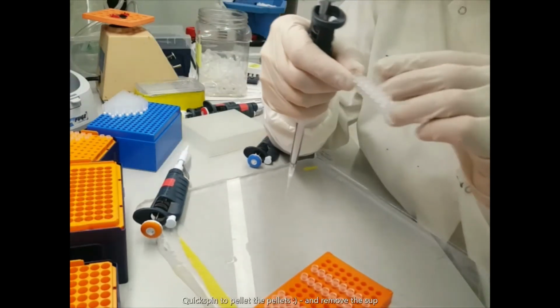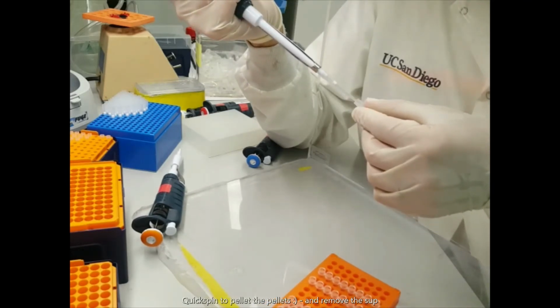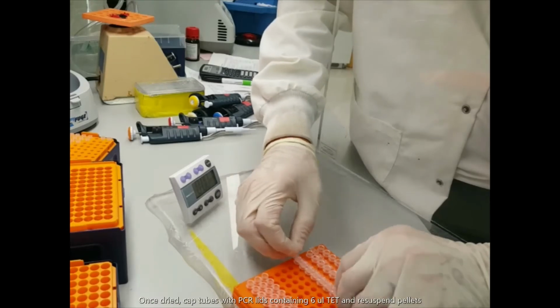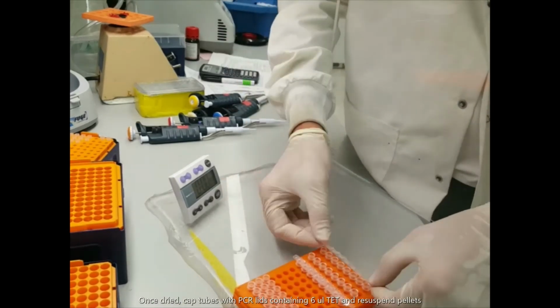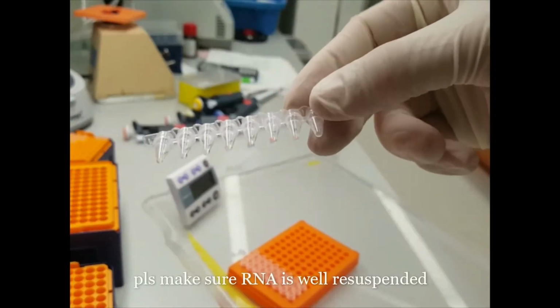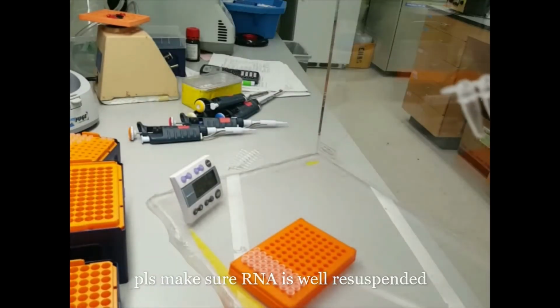Next, quick spin the PCR strip and remove all remainder of the 75% ethanol. Dry the pellet for about 3 minutes. Once all pellets are dried, you can now add the PCR strip lids containing the 6 microliters of TET to close the tubes. Vortex the samples well till all the RNA samples are well resuspended.